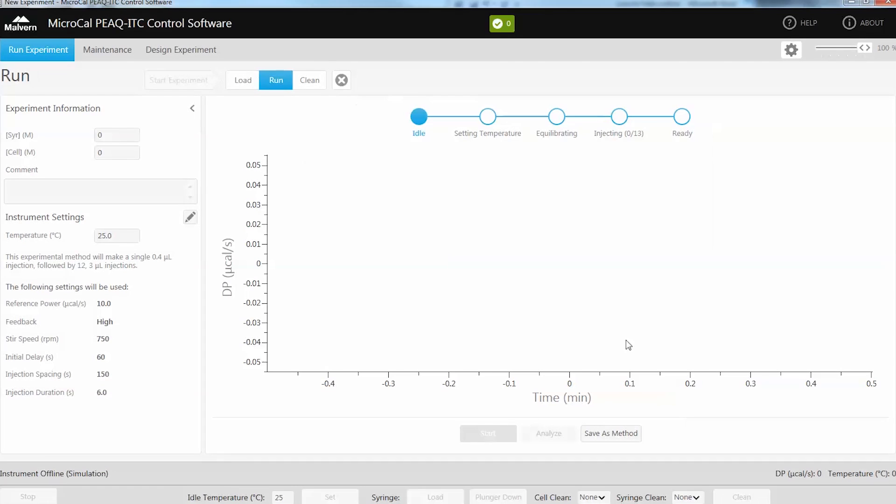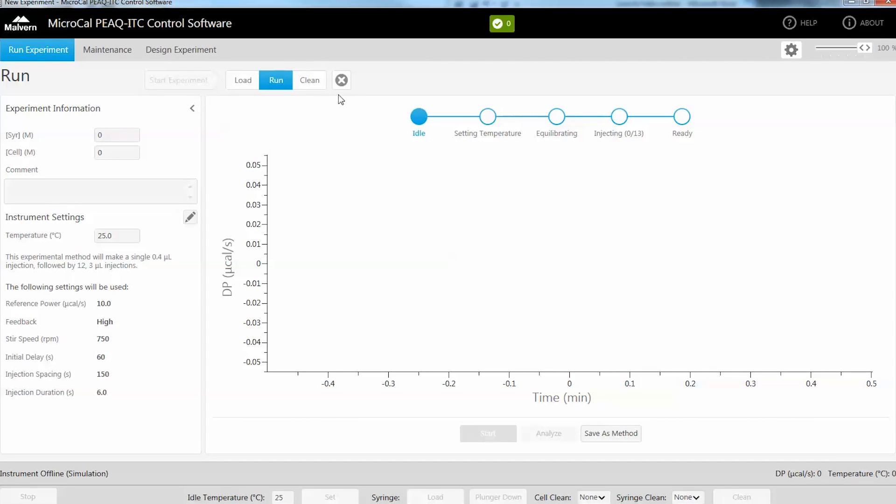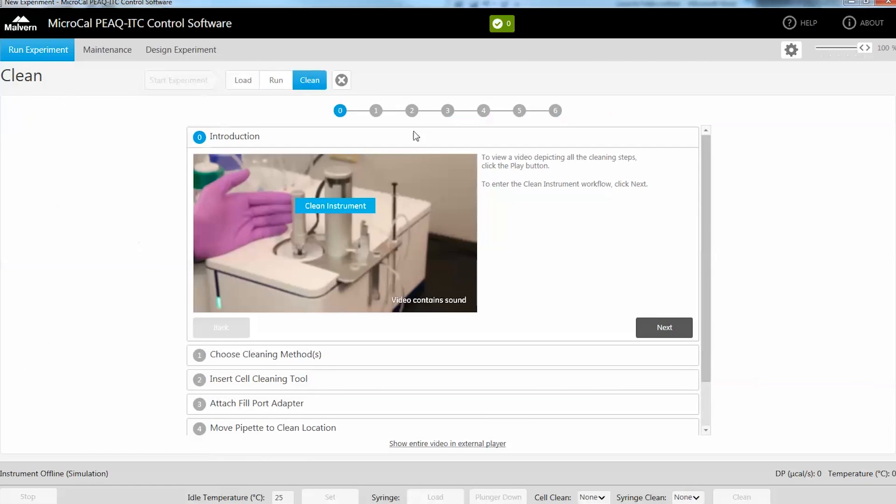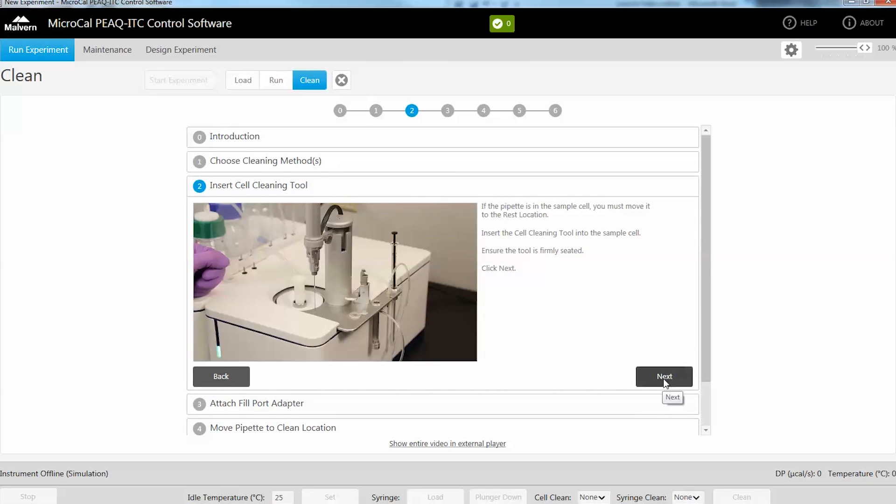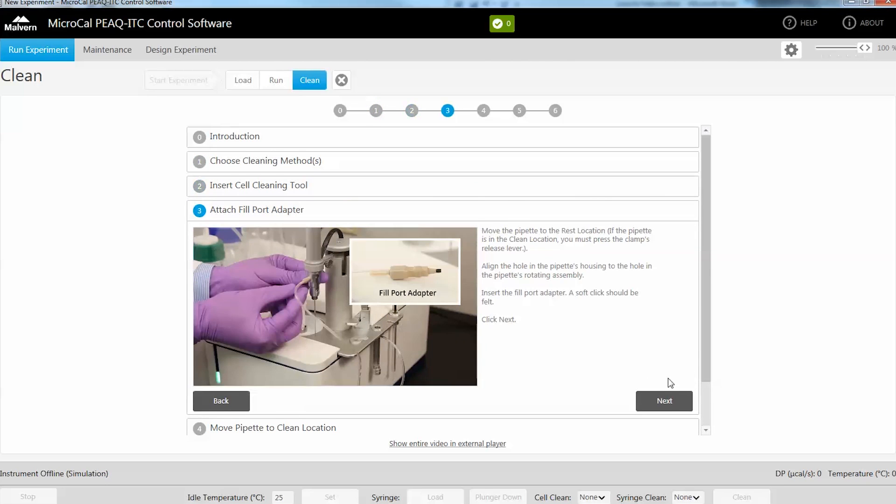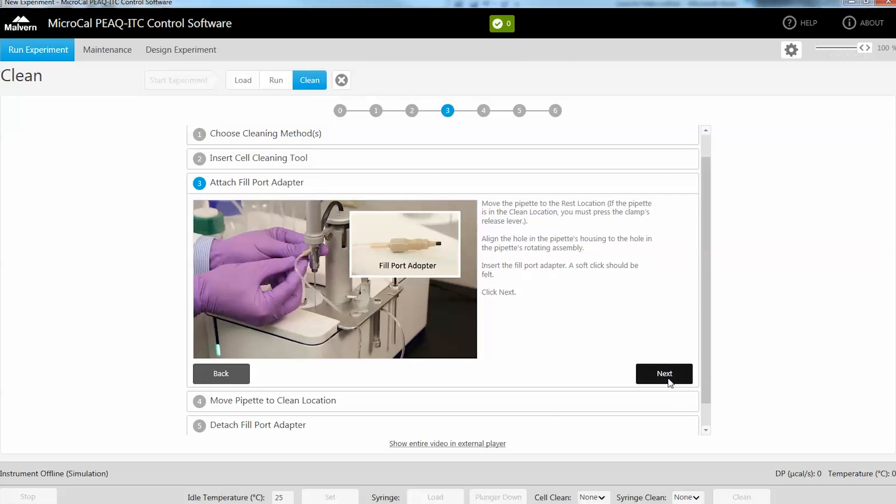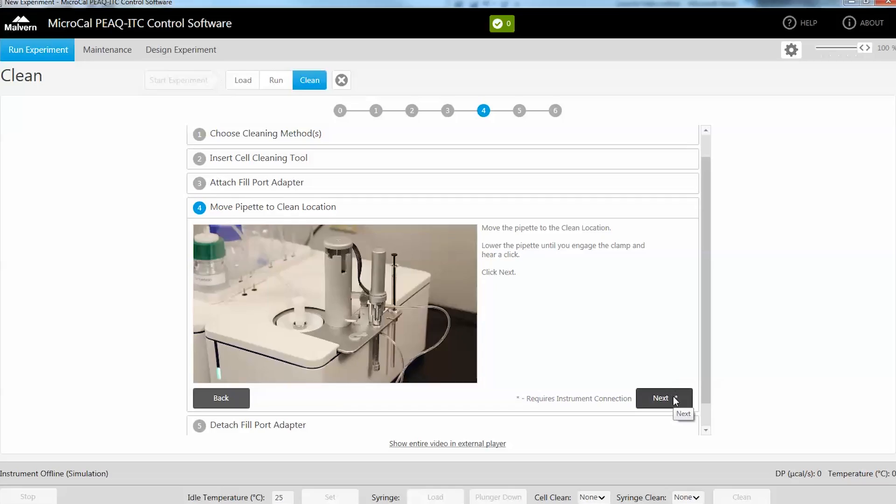The software opens in the run step of the run experiment workspace. Running through the guided workflows there are selections of embedded videos that run a user through the cleaning process before selecting the type of cleaning required.